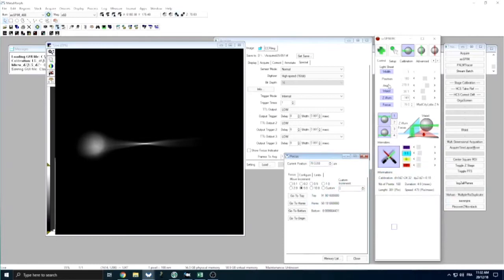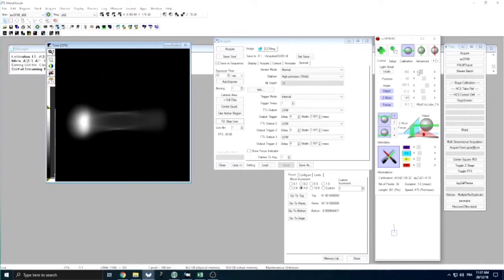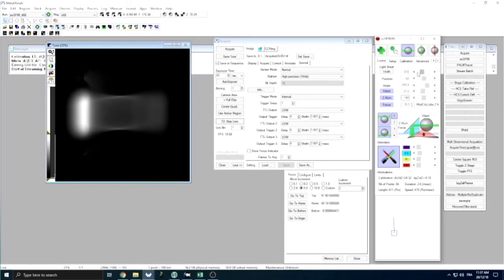We can now adjust the width of the light sheet and its position in the camera field of view, as well as the position of the waist of the light sheet according to the size and position of the samples in our wells. We can now set everything up for 3D imaging.